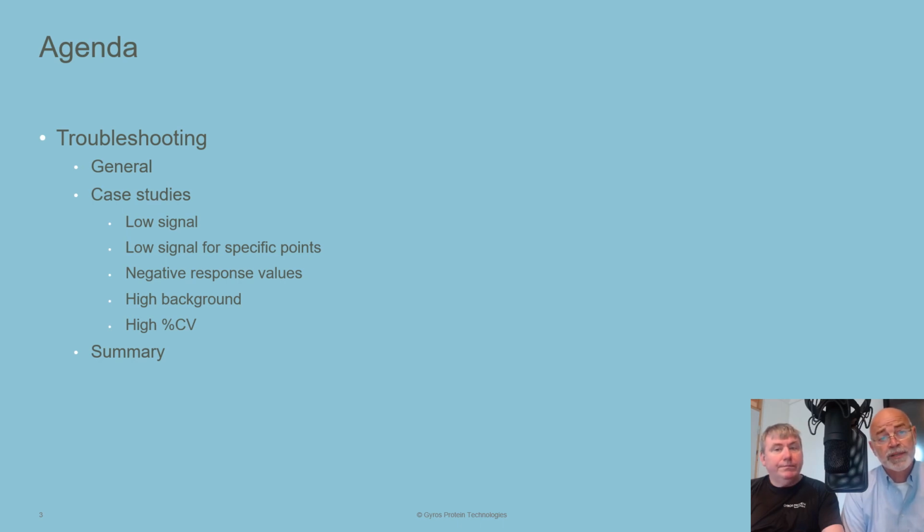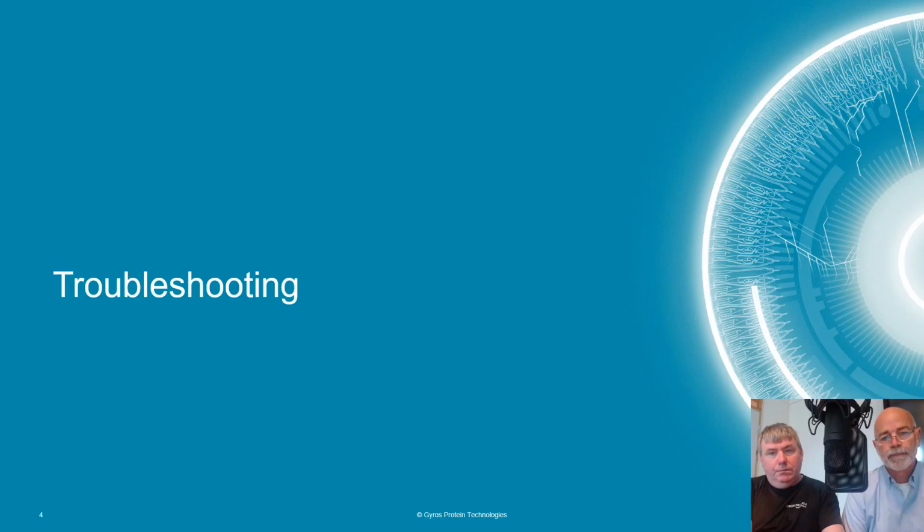Yep, so today's agenda then is we're going to talk a little bit about troubleshooting in general and then go over a few specific case studies so that we can help you to think about troubleshooting when you're seeing specific problems with your assays. So let's kick this off and we'll talk about troubleshooting in detail.